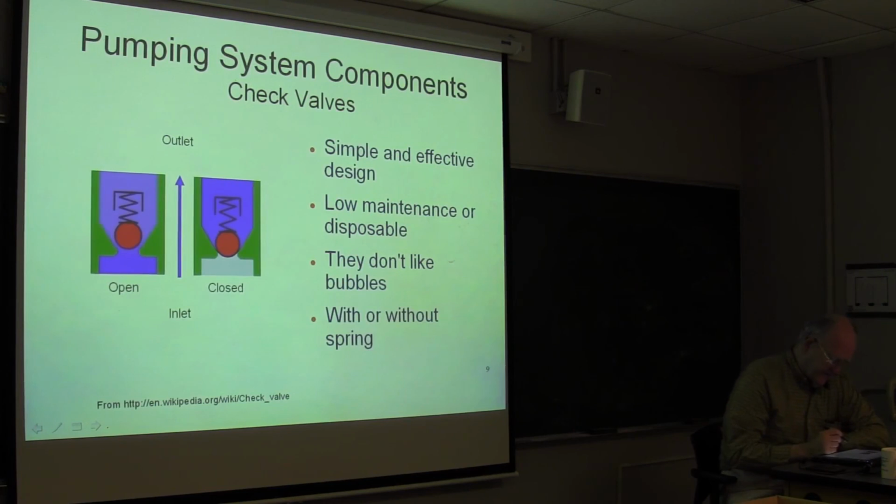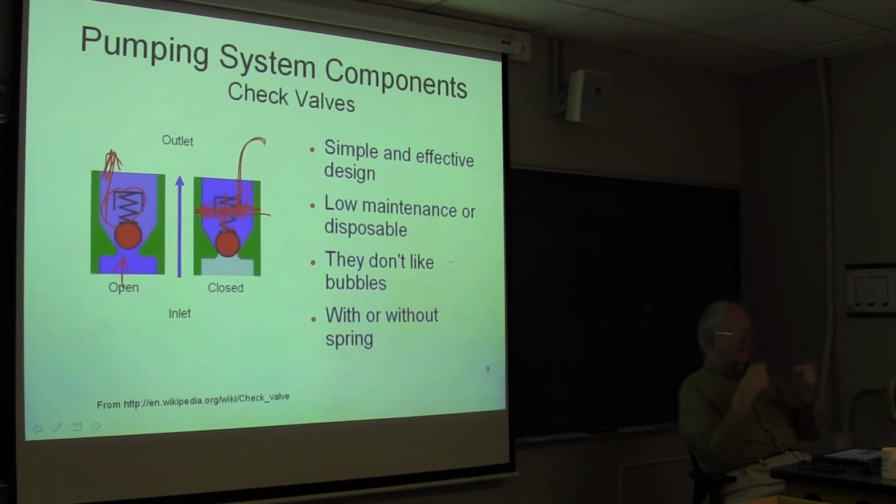This explains how the check valve works in a little more detail. In the open position, the pressure is pushing the check valve up against the spring. And in the closed position, when the stroke is going the other way, the spring is pushing the check valve down so that we can't have any flow in back of the check valve. So the flow is out in that direction, and then there's no flow in that mode. And the inlet check valve and outlet check valve work 180 degrees out of phase with one another. So one is open, the other's closed. Okay? You can see that these things are not trivial. And it doesn't sound that bad to me to spend $5,000 on a really good pump anymore.